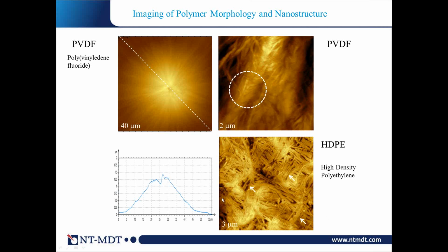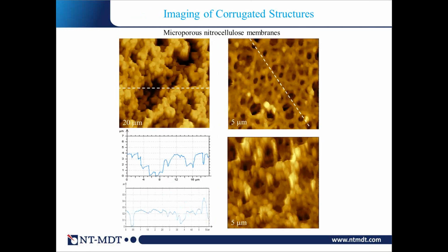And that shows you that you really can get a lot of these details with relatively high resolution. But these surfaces, at small scale, are pretty smooth, and that's easy. Actually, the AFM is the best when the sample is very smooth. But however, our life is different. We need to look also at samples which might not be very smooth, and here are a couple of examples.